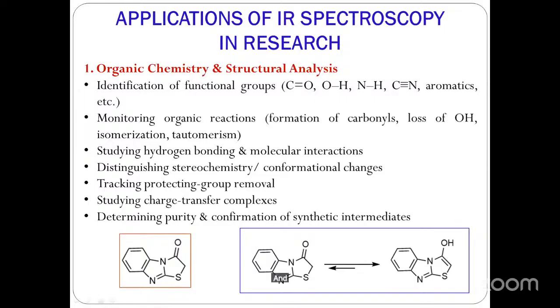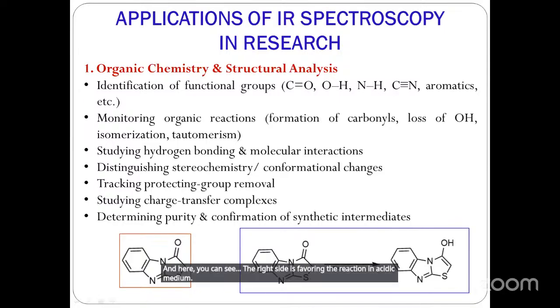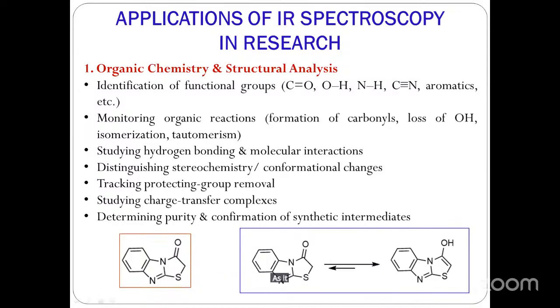And here you can see the right side is favored in acidic medium as it has an aromatic nature, and aromatic compounds are quite stable. So this conversion we determined by using IR spectroscopy. So monitoring a reaction becomes easy when you have this instrumentation.